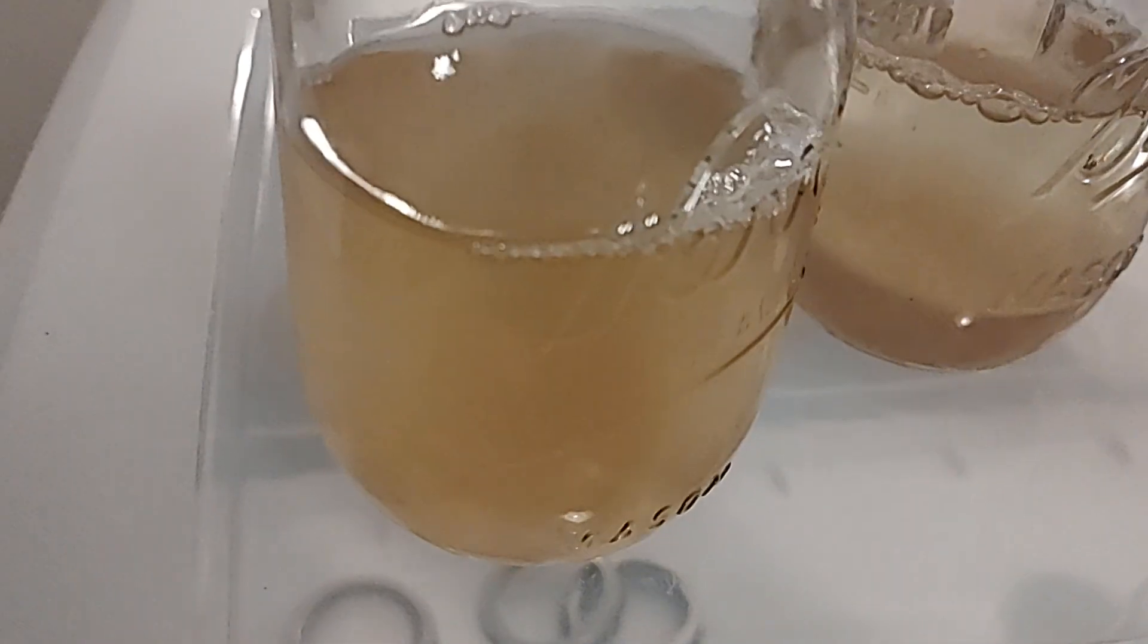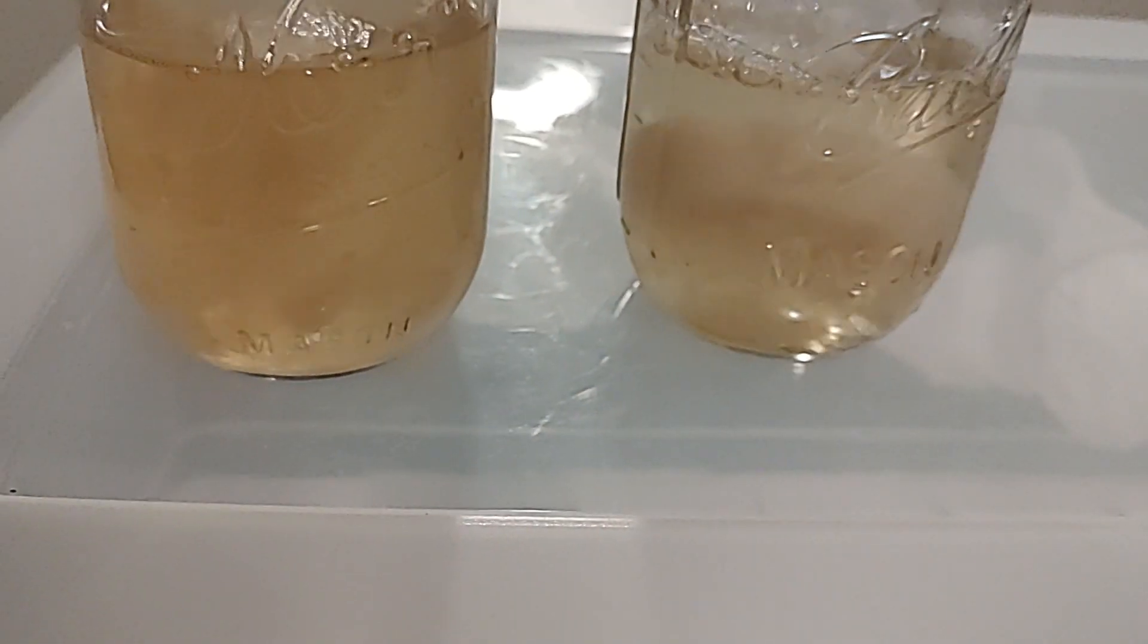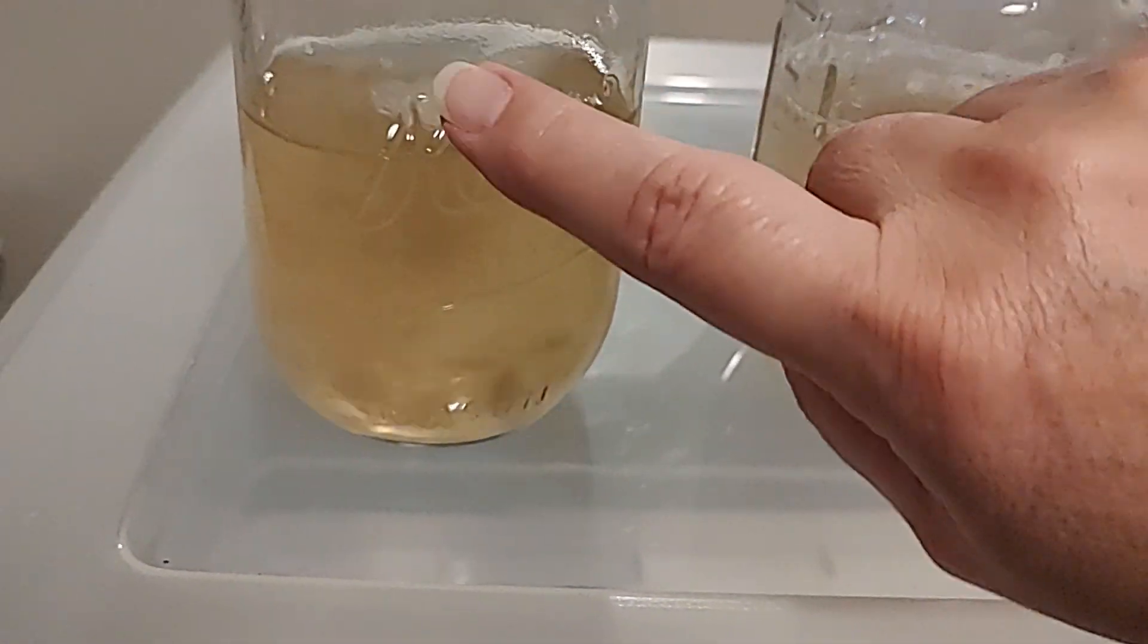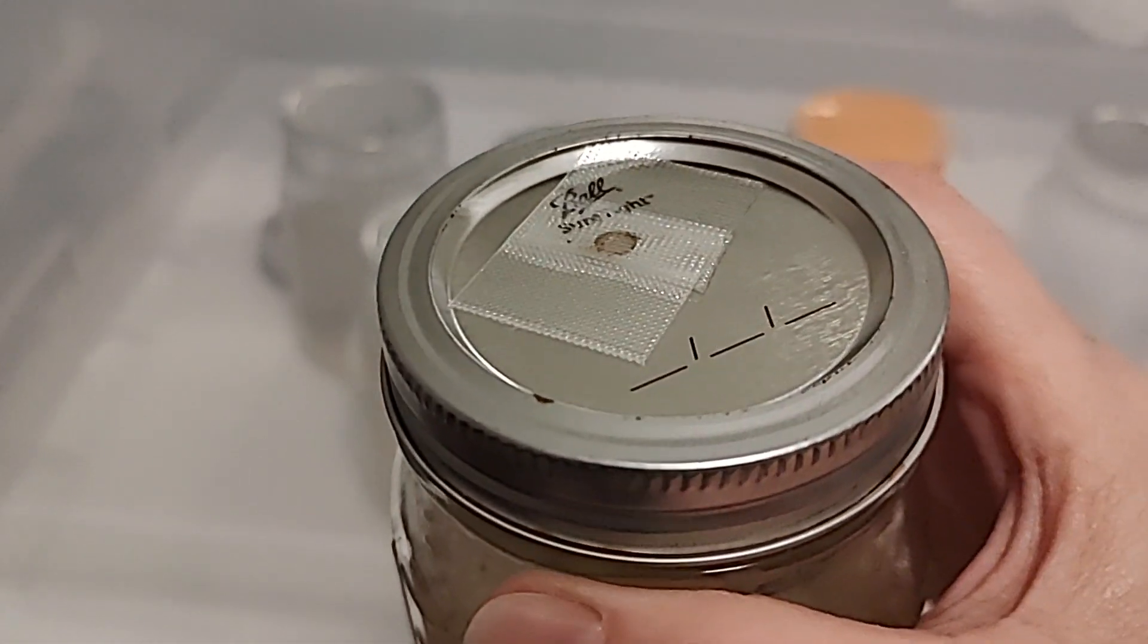I just wanted to show you because there are a lot of questions about LCs and slurries. A lot of people I think are not understanding the longevity, the shelf life of LCs and slurries, especially when you have these modified lids with air exchange.